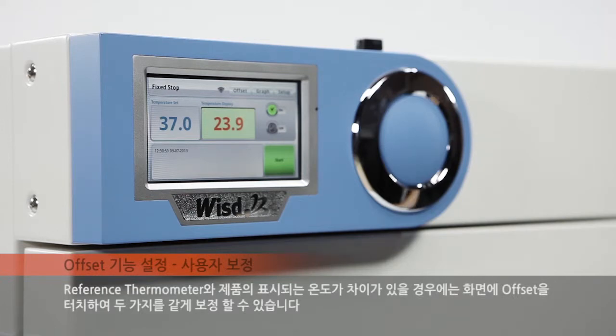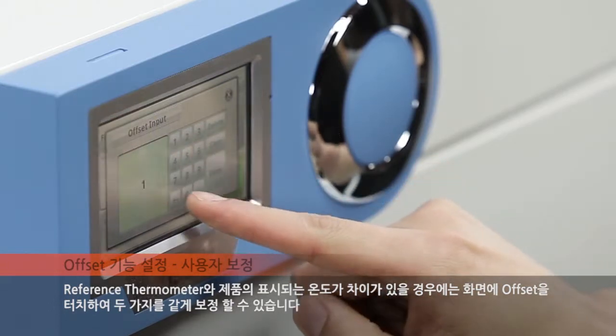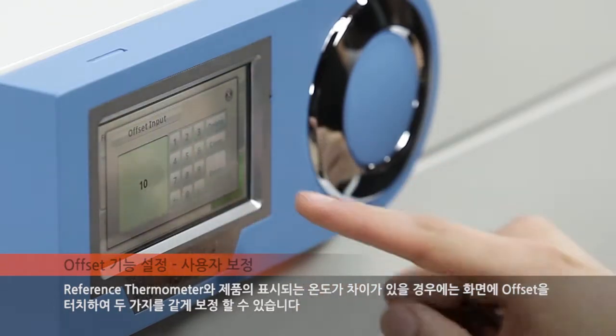If a temperature offset exists between the reference thermometer and the device, touch the offset on the screen to calibrate both to equal one another.